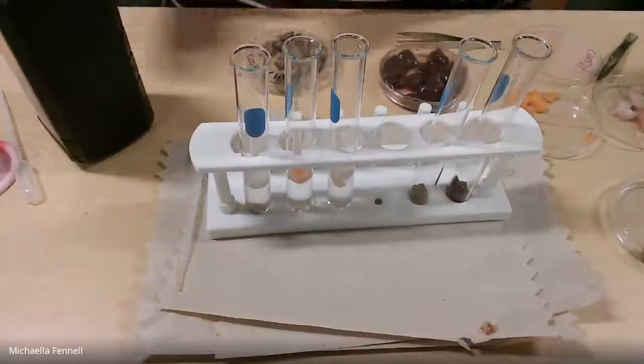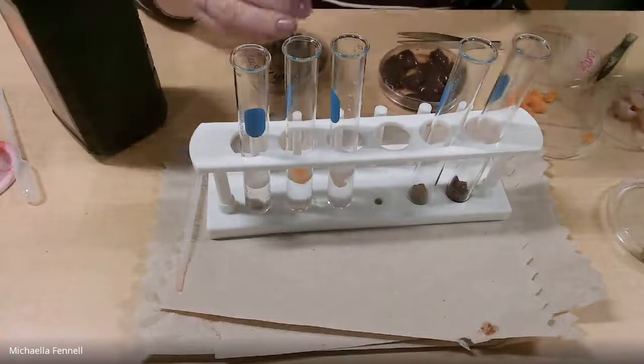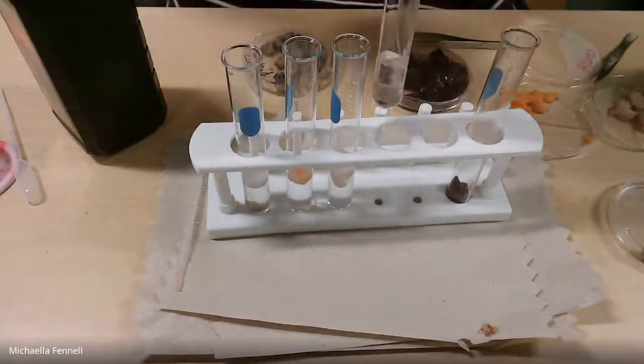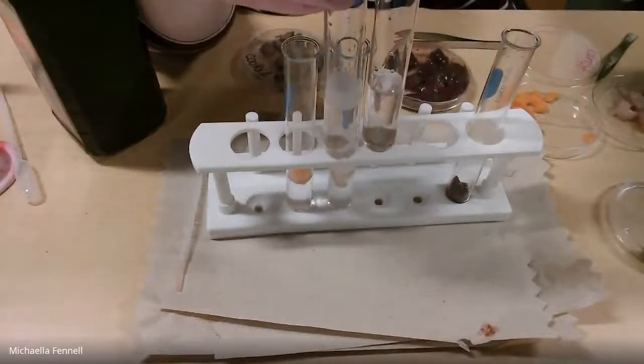Then we have the liver. Let's put the 10 milliliters of hydrogen peroxide on the raw, or excuse me, this is the cooked liver. Cooked liver has not much going on at all. Look at that.